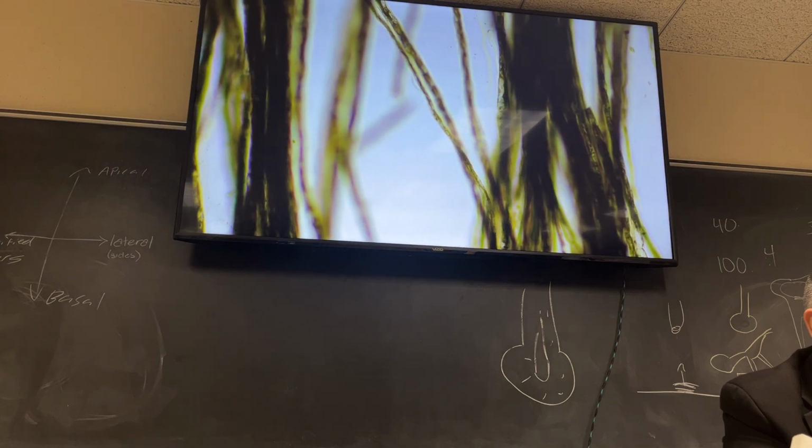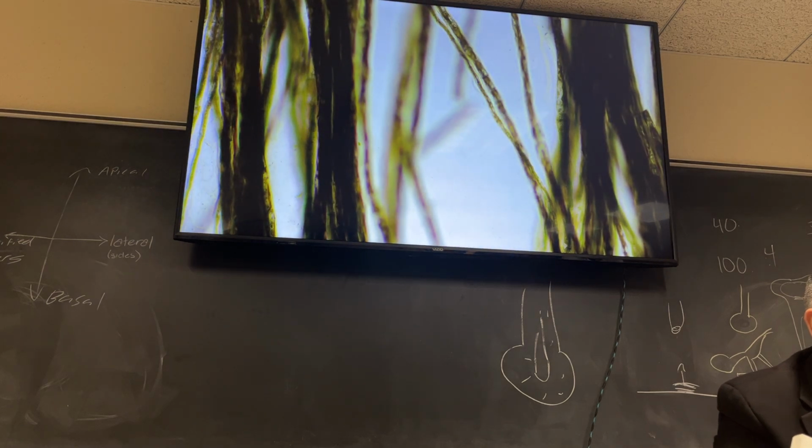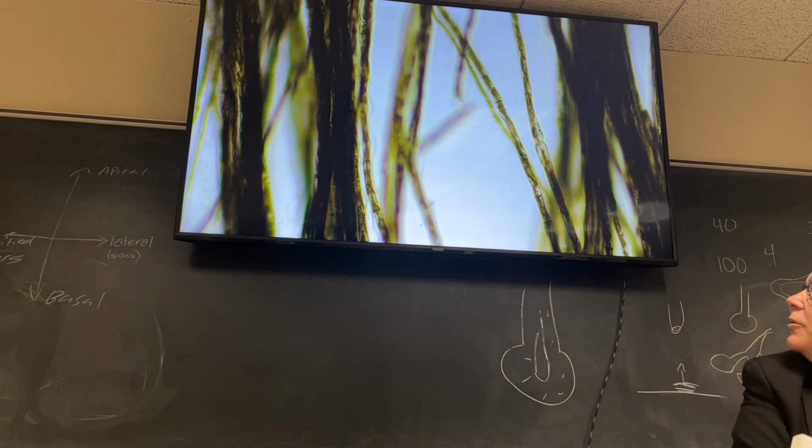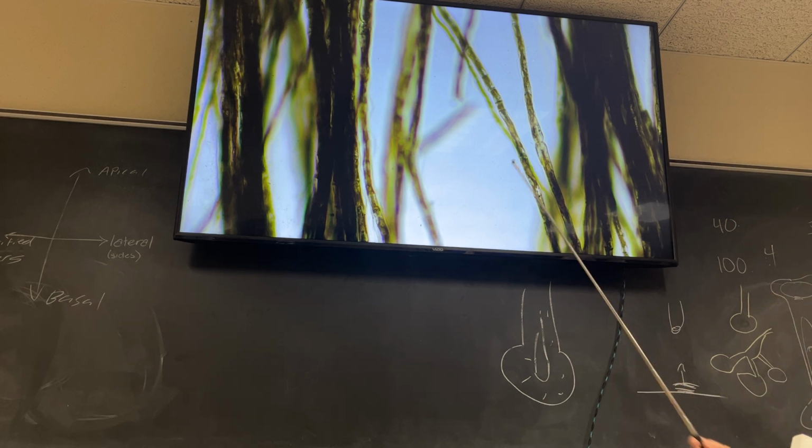I really don't care where we look, it's all fine. How's that look? Pretty wild looking, right? So there are several different things we need to look at here. Here's one of those nerve fibers. Doesn't look like a continuous thing, does it? Looks like it's disjointed, right?